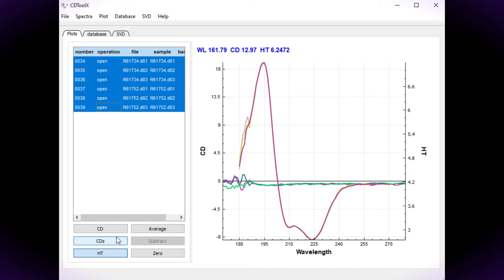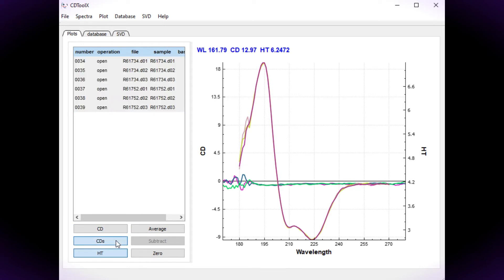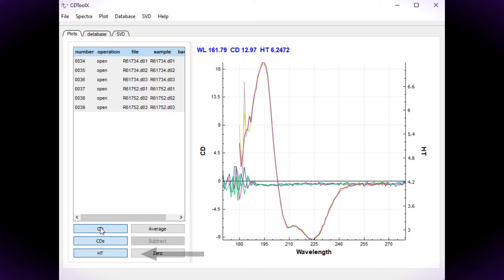The default view in the plot window is of the smooth CD data. You can also view the unsmooth data and the HT signal by using this toggling system.